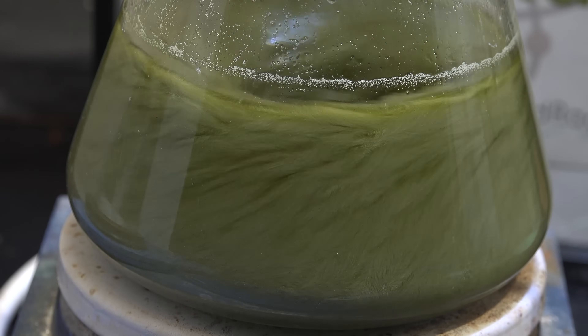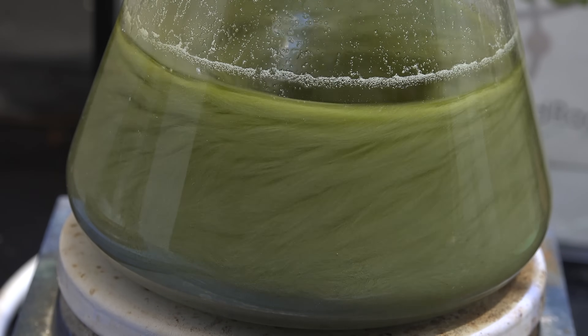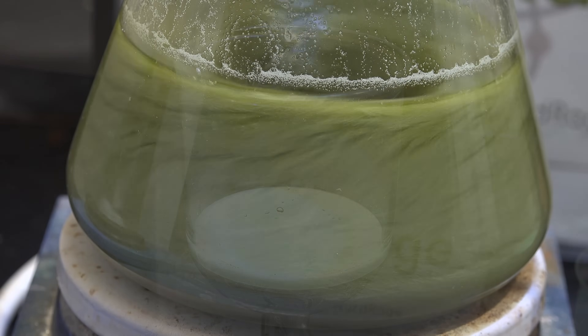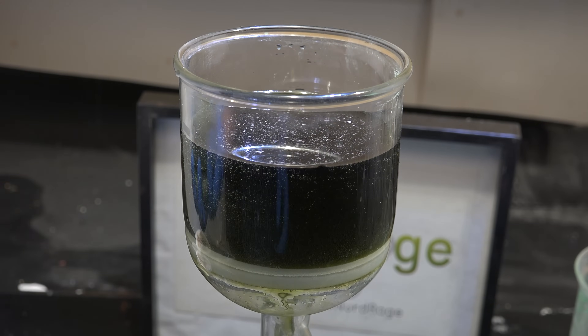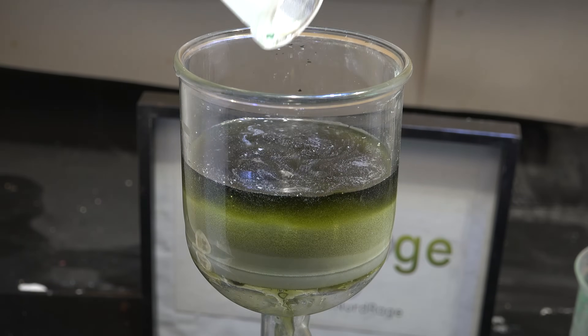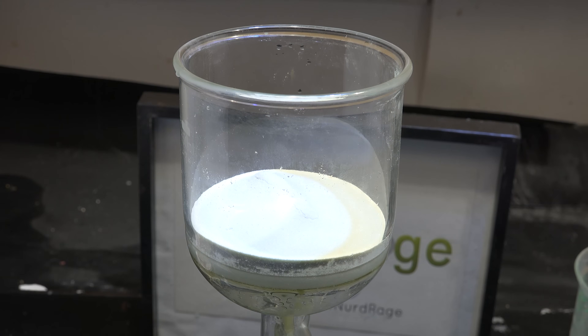I ran about three cycles before I decided I had enough. For the last cycle, don't regenerate the copper chloride — instead let it precipitate and cool to room temperature. Then filter the mixture to remove as much of the copper chloride as possible. This is another reason why I removed the excess hydrochloric acid at the beginning: if the copper chloride remained dissolved it would make our sulfuric acid recovery much harder.